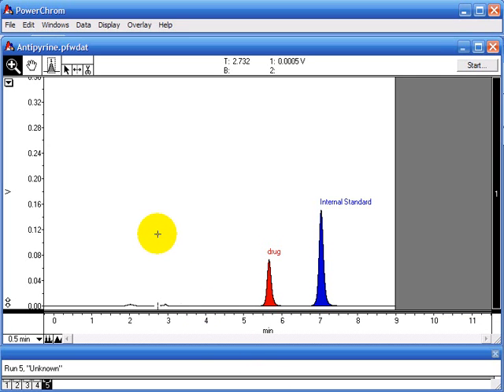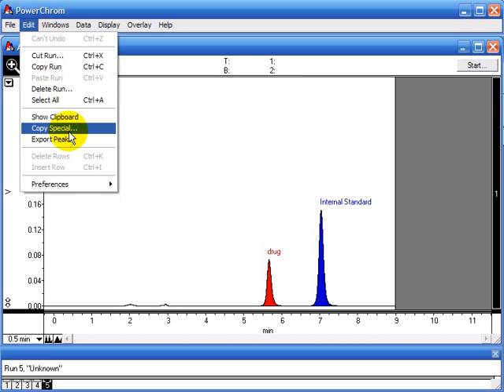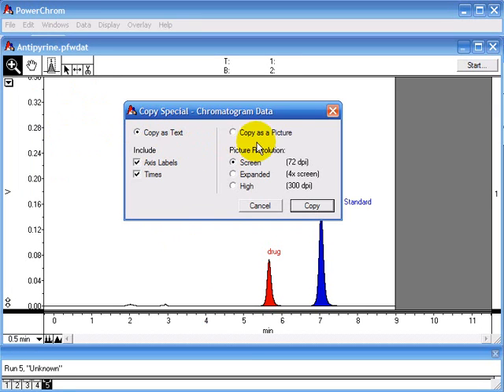If you are doing a publication or a presentation, you might want to copy this as a picture. If you click on Edit and Copy Special, this time you can choose to copy as a picture.